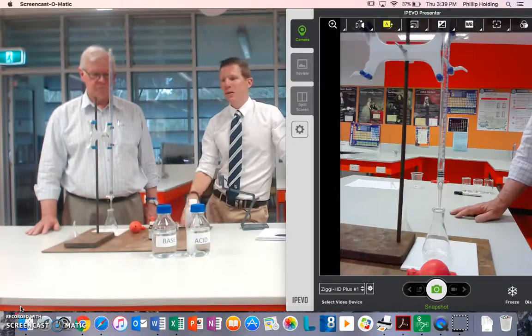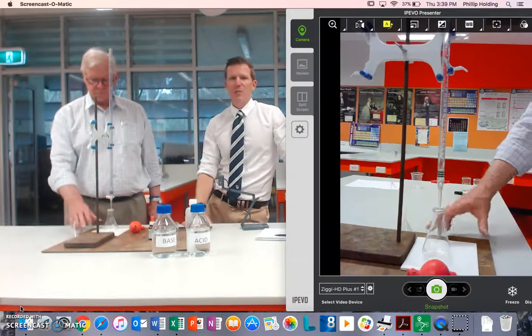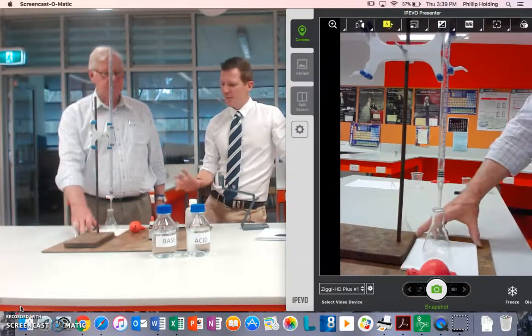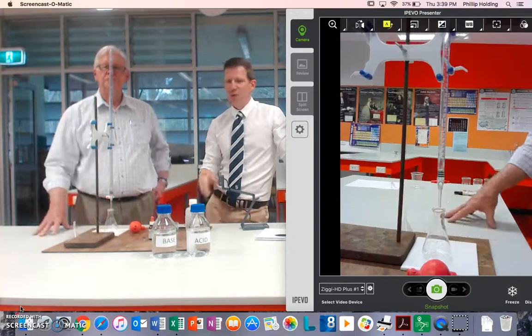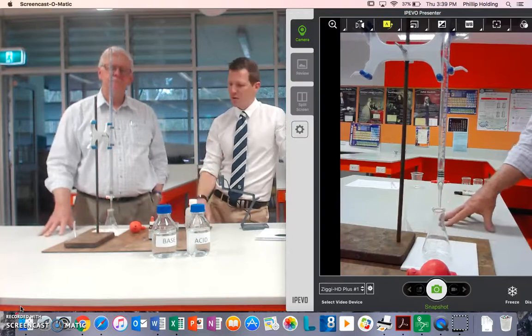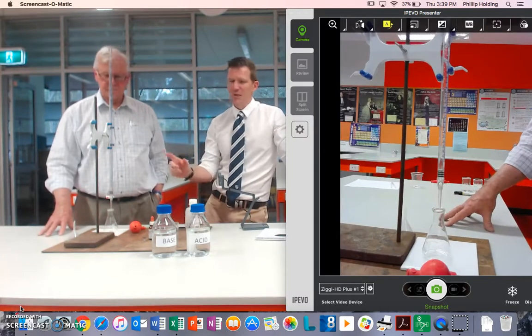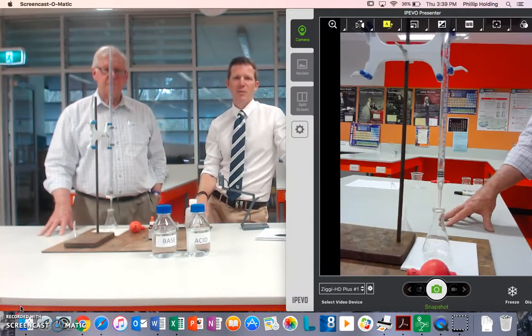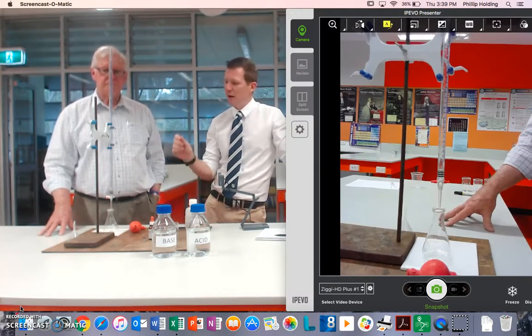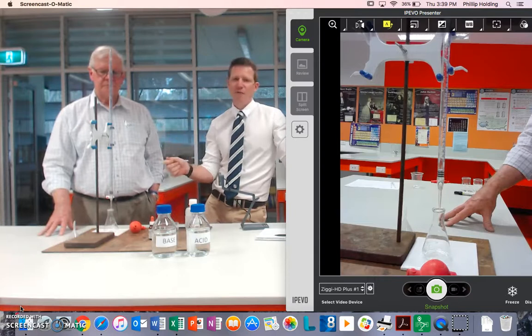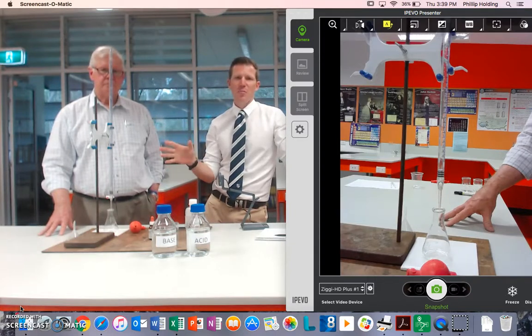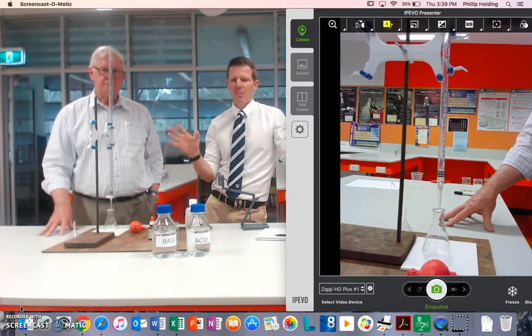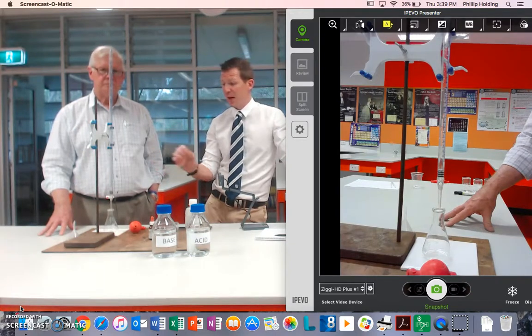Hi guys, it's Mr. Holding here and Mr. Jarrett. This quick video is following on from our other series. In this one, we're going to specifically look at how to fill and use a burette accurately.